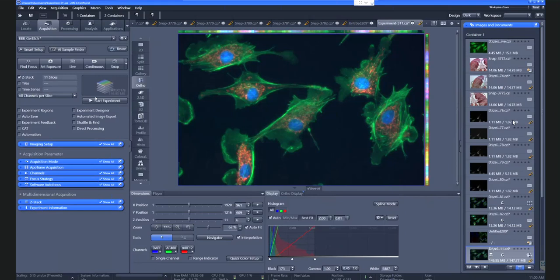And as we will see in one of the next sessions, we got some new options coming with processing, like deblurring, like bio apps, which gives us easy access to kind of image analysis. So this is new with 3.4, but the interface we are looking at here for getting images, acquiring images, is the same. And 3.0 to 3.4 did not change much, I would say. So the interface basically stays the same, but we have new functionalities and so on. And there's never the need always to have the latest version, except you need some functions and you want to keep your system updated. And we permanently do these kinds of settings in webinars, I guess. So we pretty much like to introduce the new stuff to you, and then you might come back to us and see whether it's worth it.